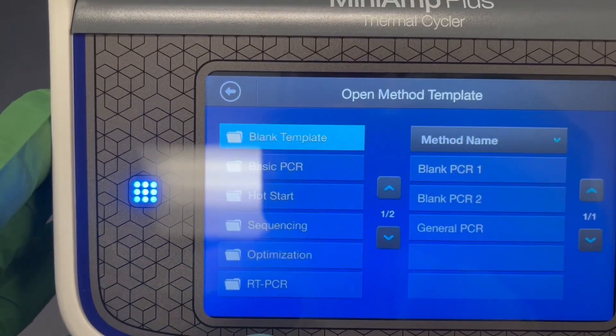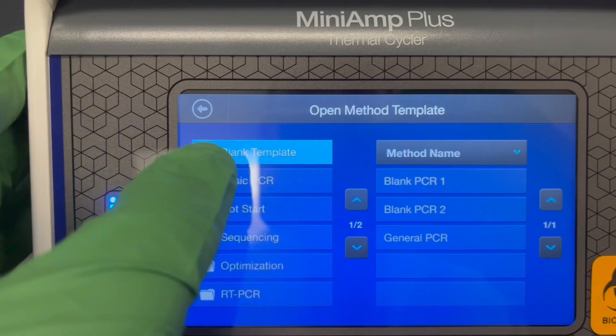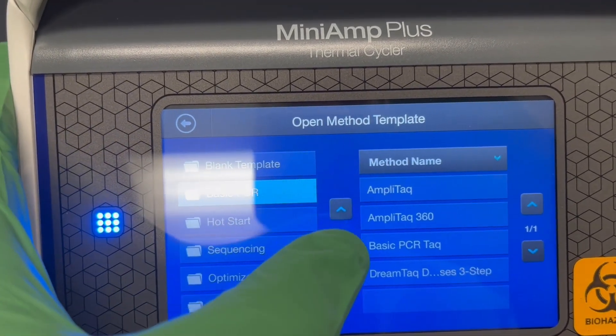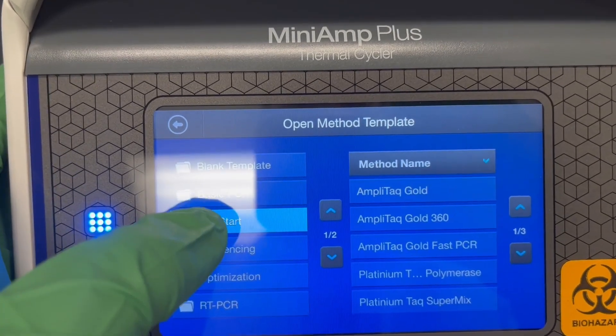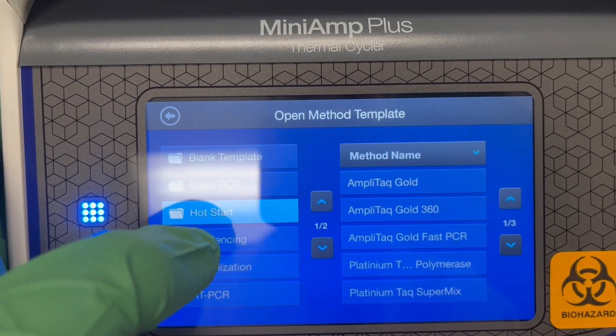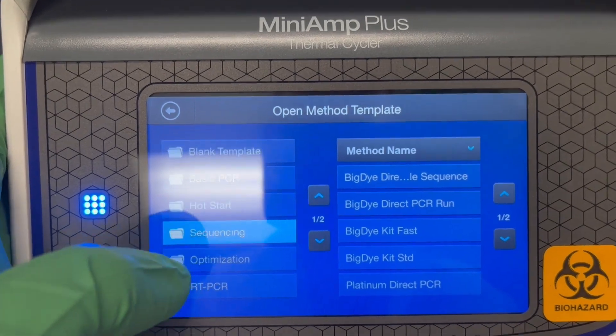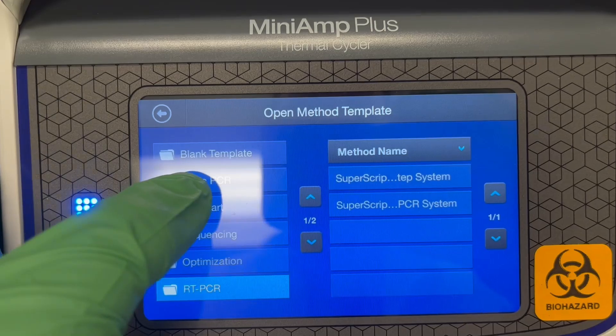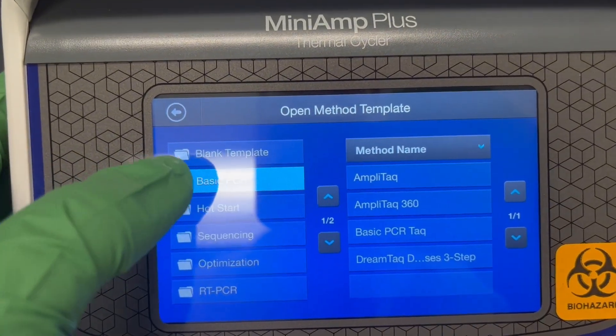Otherwise we're going to hit Open Template. There are blank templates, but also in these folders if you use AmpliTaq, AmpliTaq 360, DreamTaq, or any of these hot start options like AmpliTaq Gold, or even if you're doing a different sequencing reaction or an RT-PCR reaction, there are some protocols already programmed in.